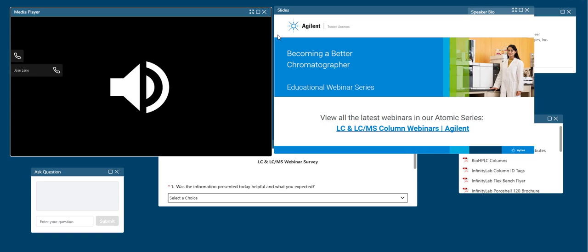It's not necessary if people are doing multi-detection, unless they're doing calibration. Universal calibration will require calibrating the columns.